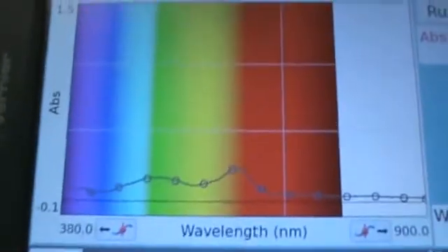Here I have some of the purple, which did not separate well. When I put the purple in, you're going to see both peaks.